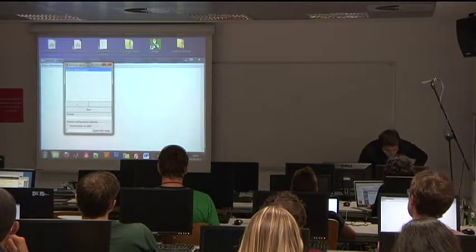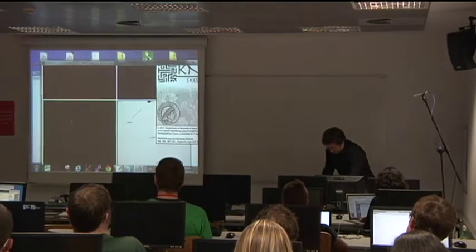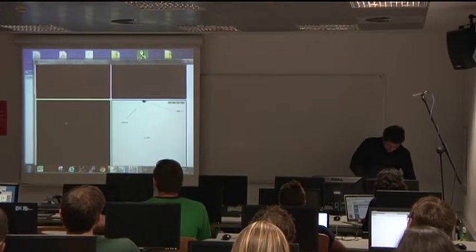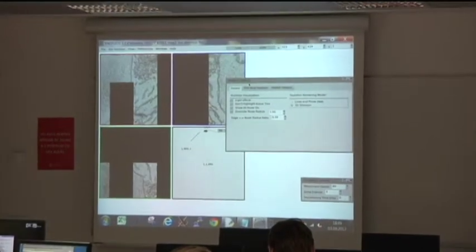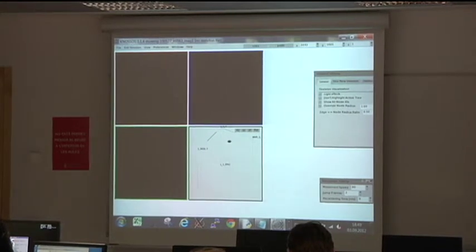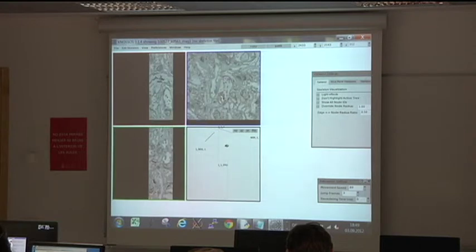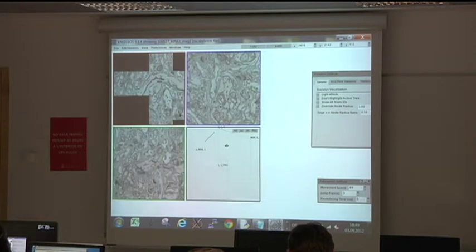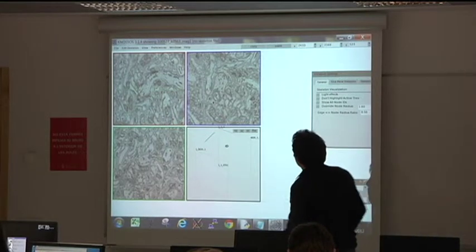program Knossos that we've used for EM, but Partha also showed can be used for LM. And this is now a data set, again from the mouse retina, but it does contain intracellular staining, and I just want to make you familiar with that very briefly. And now this is finally really tutorial style. So why don't we try to find out what we can see in such data.